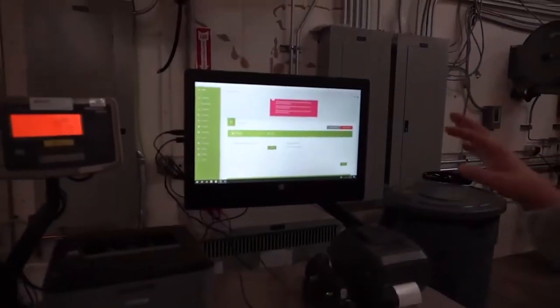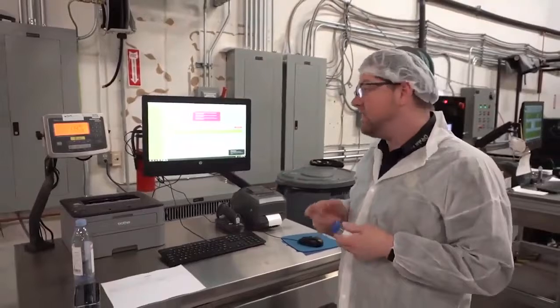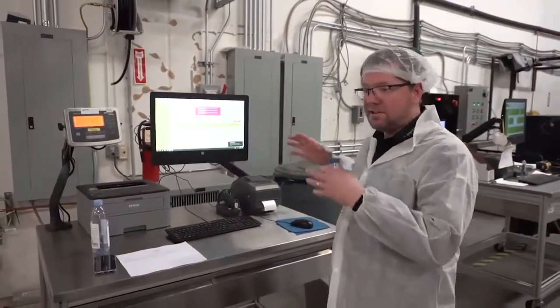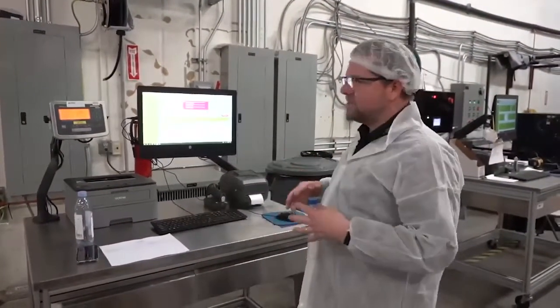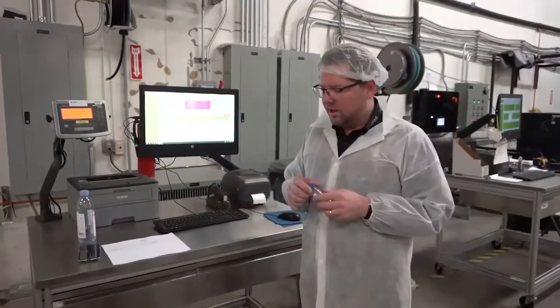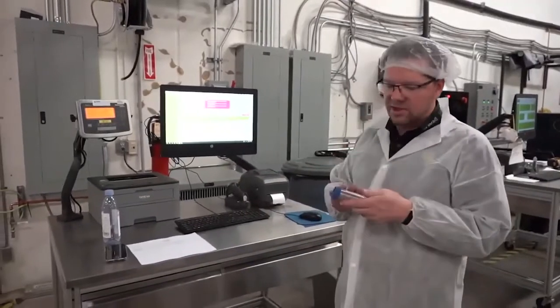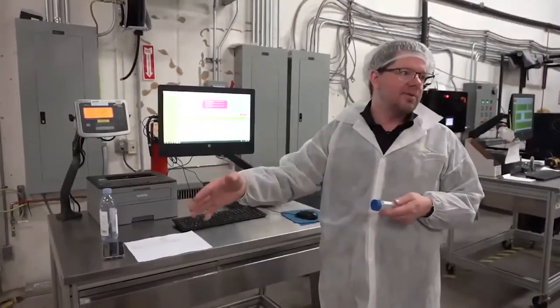What's nice about this, and I had mentioned this when I was in the laboratory information system, is that I'm able to really take a sample here. I'm able to tell the laboratory exactly which tests I need, and it's also tied to this lot. So the results here are really attached to the batch record right from the beginning.